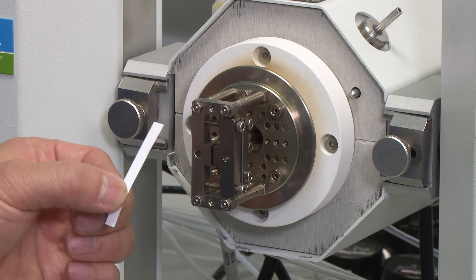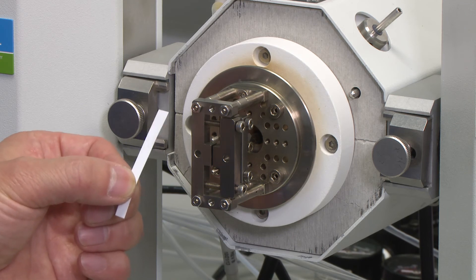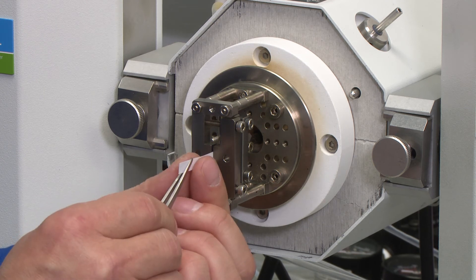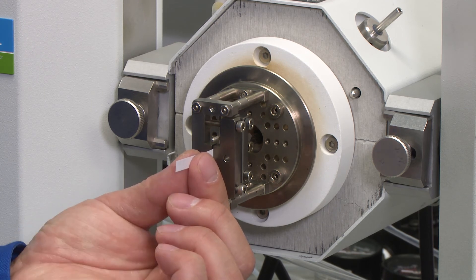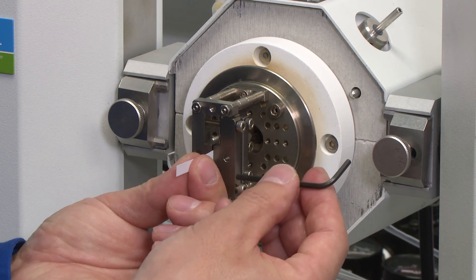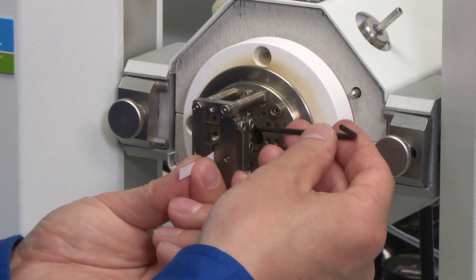The width of the sample is typically 5 millimeters wide. So we can slide in the sample into the inner clamps. While holding the sample straight, the inner clamp is tightened.